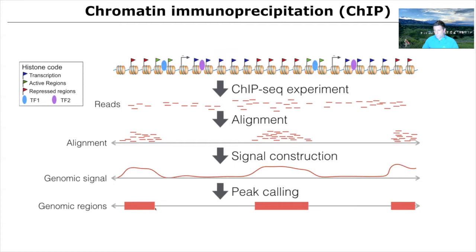And so what we're going to go through is each of the steps that the pipeline pumped out, but this is just getting closer to what that is: the FASTQ files are simply a bunch of reads. We align them to the human genome, and you can see them starting to clump up here. And MACS, which we'll talk about, is one of the programs run in the Nextflow ChIP-seq pipeline. We'll start to say, oh, I see more signal here than I do here, and it'll give you these nice handy squares where it says, I see a signal in the genome here and here and here.